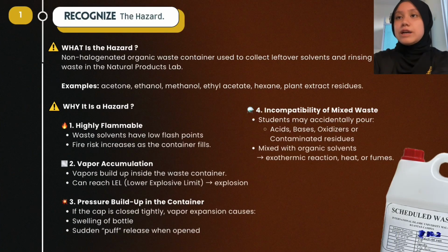So firstly, we need to recognize the hazards. What is the hazard? In this case, it is the non-halogenated organic waste used to collect the leftover solvents and rinsing waste in the natural products lab. For example, we have acetone, ethanol, methanol, etc. So why is it a hazard?